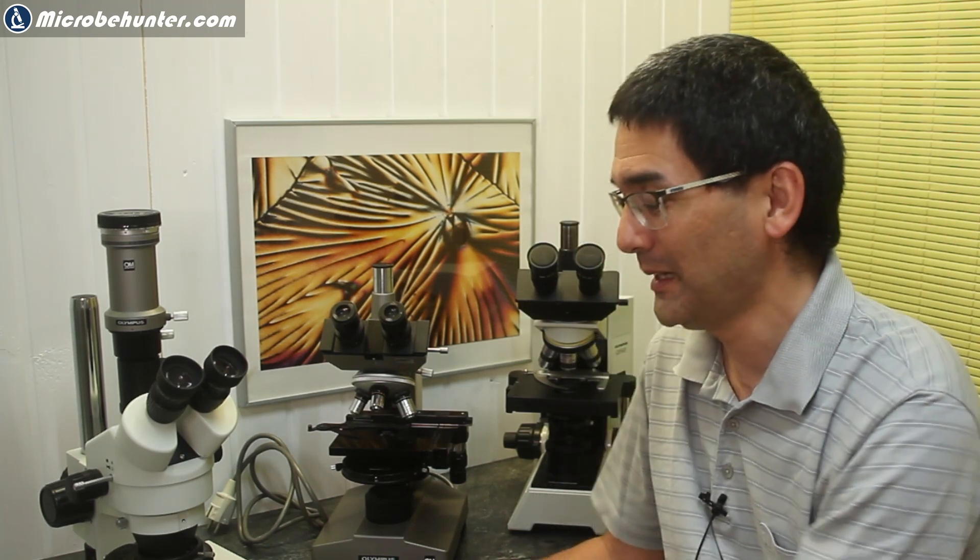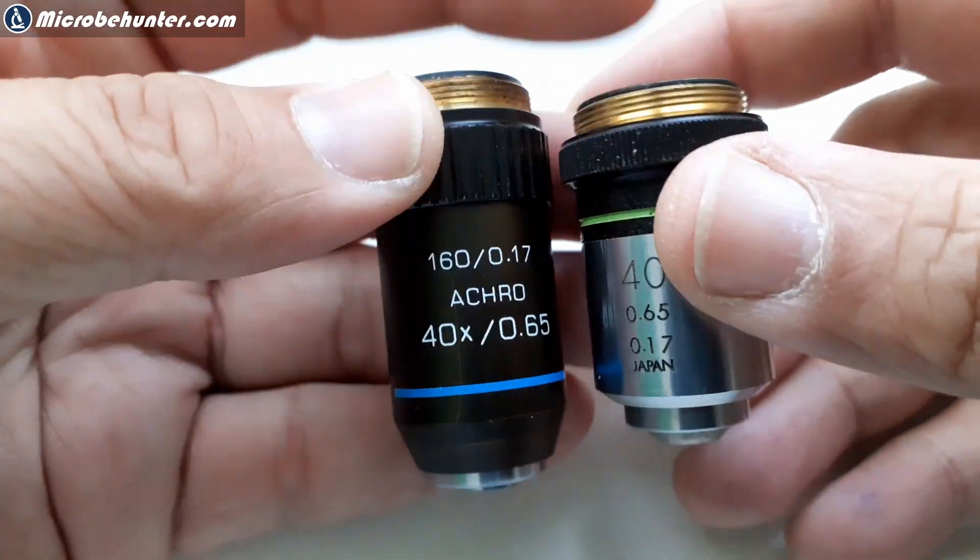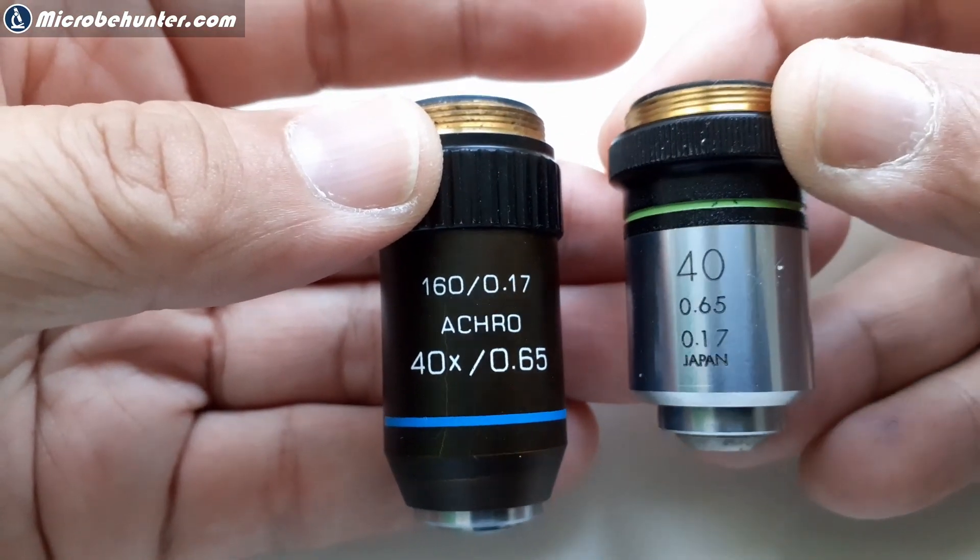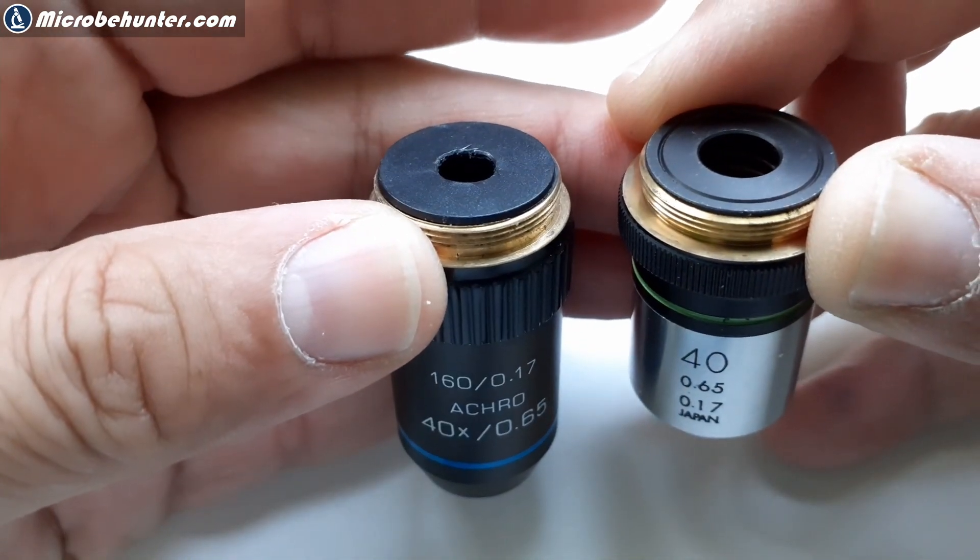Because this is a slightly technical question, I need to explain the basics here, what my viewer was actually referring to. You have to look over here. I've brought two objectives along. Both of them are 40 times magnifying objectives, and you can see that one of them is significantly shorter than the other one.